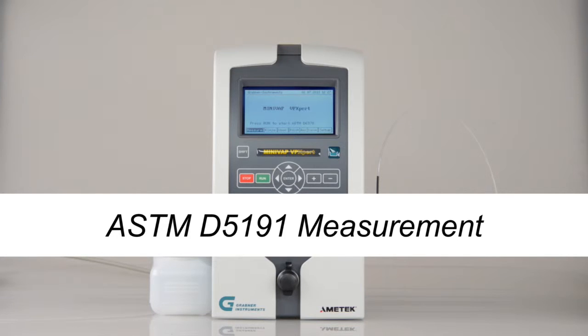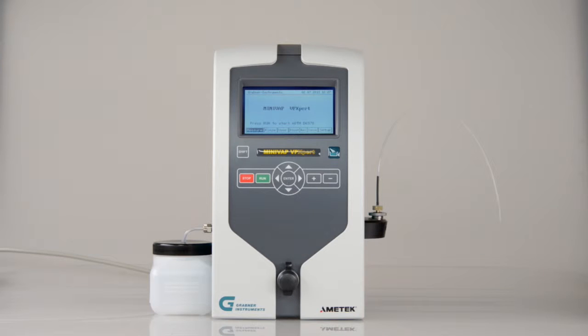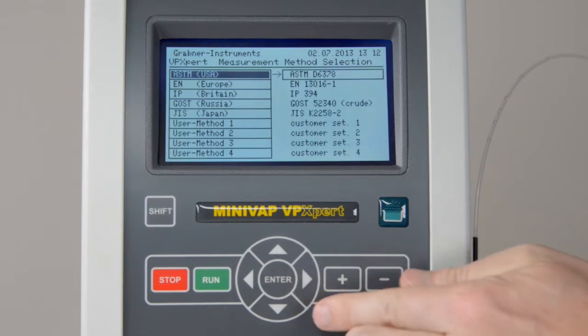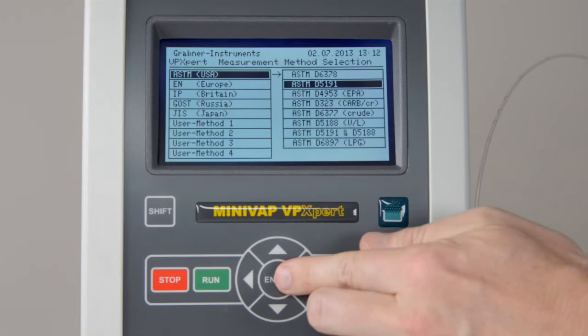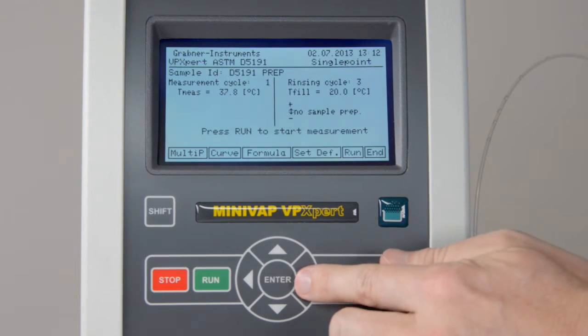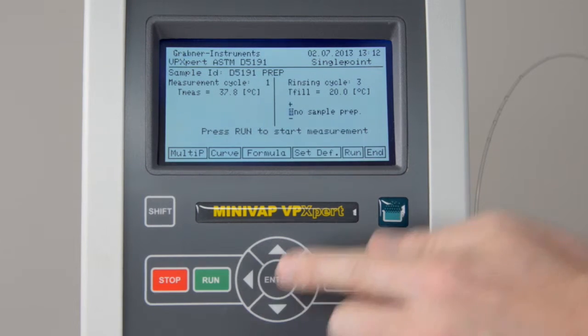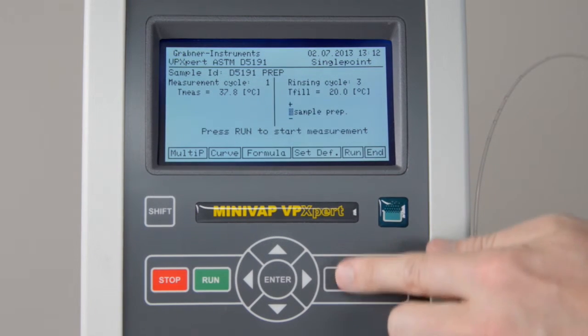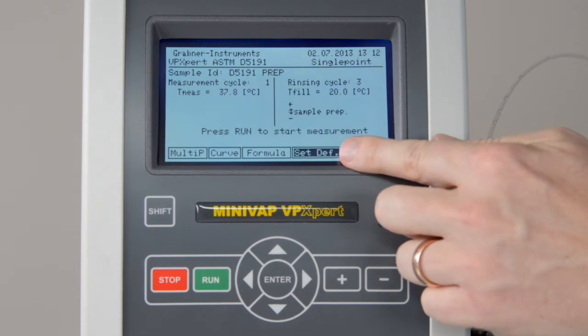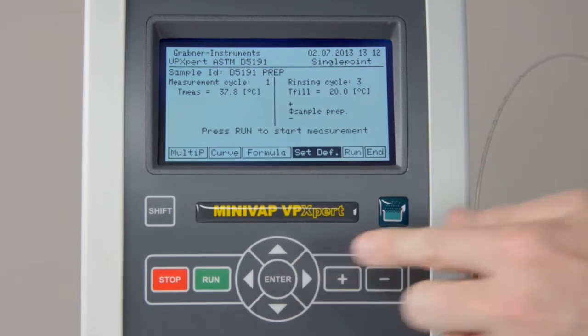ASTM D5191 measurement. A video on cooling and air saturation is available for ASTM members on the ASTM website. On the VP Expert, select the ASTM D5191 standard through the measurement menu. Select Sample Preparation. If you want to use these settings as the new default method, click on Default.